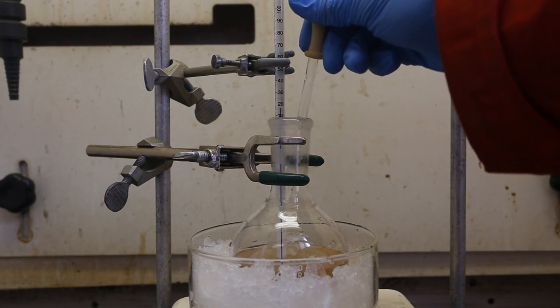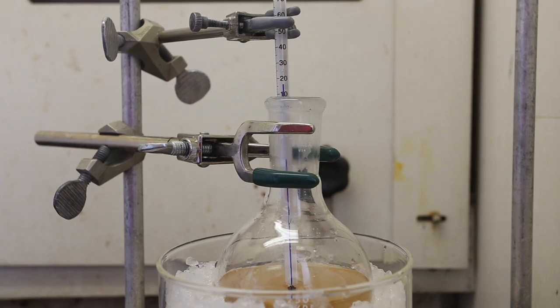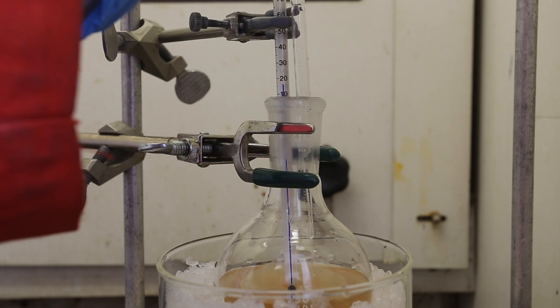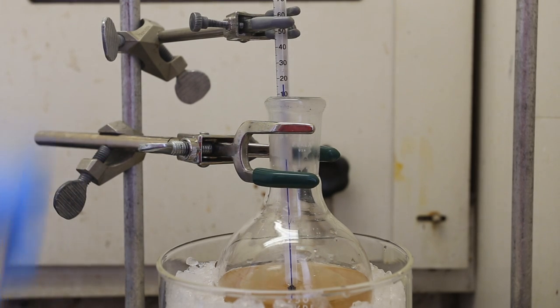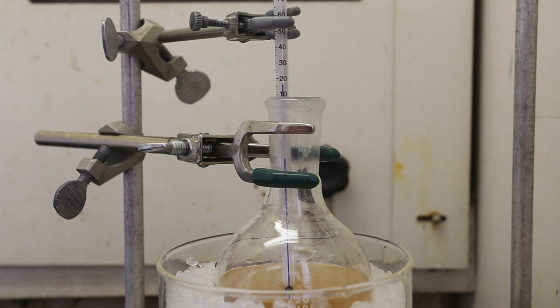Next, add the nitrating solution dropwise. The nitrating mixture must be added slowly, and the temperature of the solution must never rise above 20 degrees Celsius. We add the nitrating mixture slowly and we keep the reaction at a low temperature because we want to prevent the acetanilide from being nitrated twice.